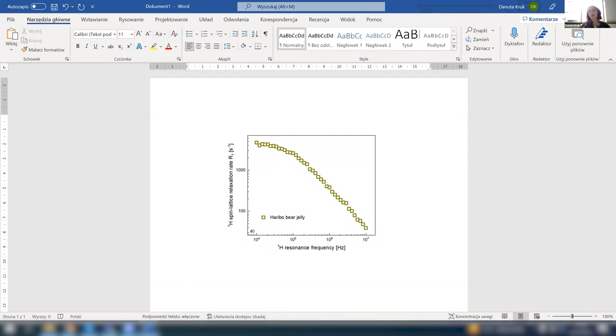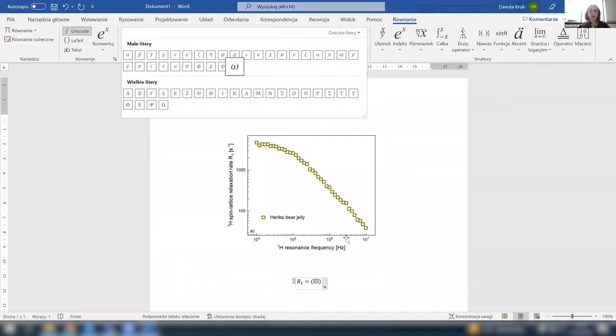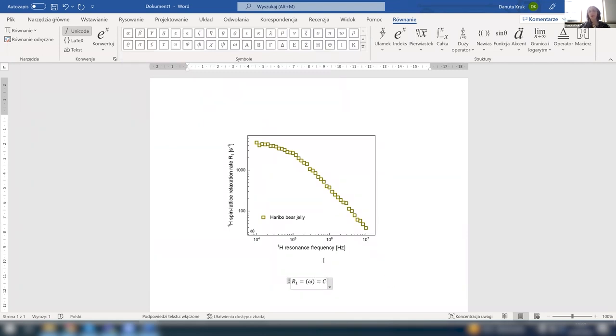And you remember, as I told you, that the simplest expression for relaxation rate is something like that. I will write it here quickly. So it's the relaxation rate as a function of the resonance frequency. So the resonance frequency is omega, and it is like a dipolar relaxation constant, which somehow includes information about distances between interacting hydrogen nuclei and some information about the fraction of bound water in case we deal with water, which is not necessarily the case here, times a very simple combination of Lorentzian spectral densities. This is something which I suppose you remember.